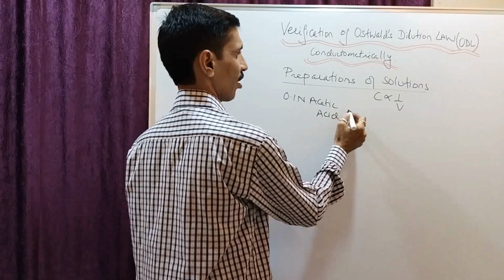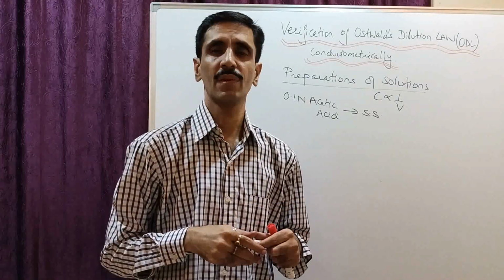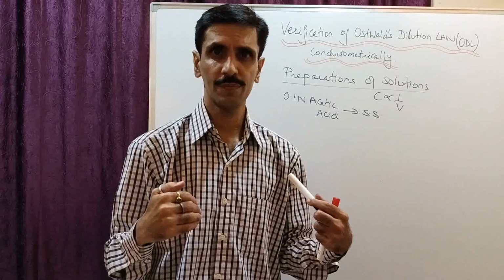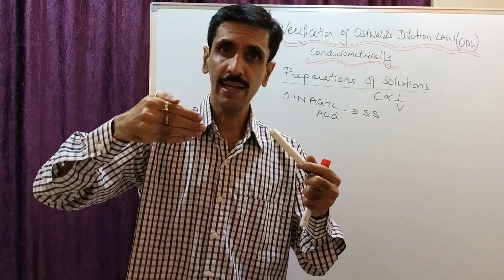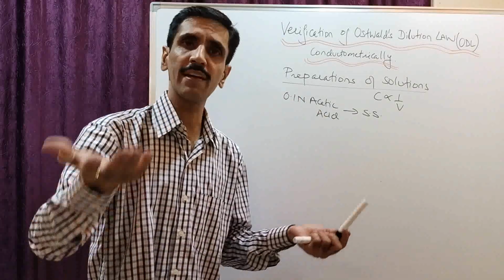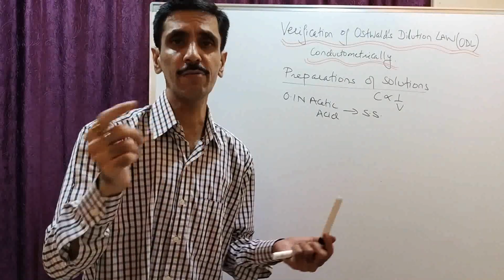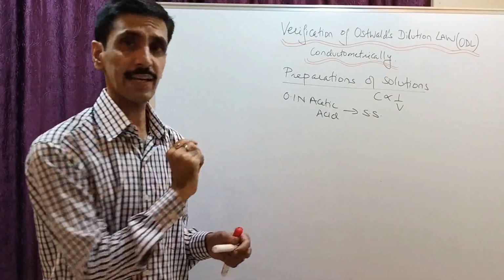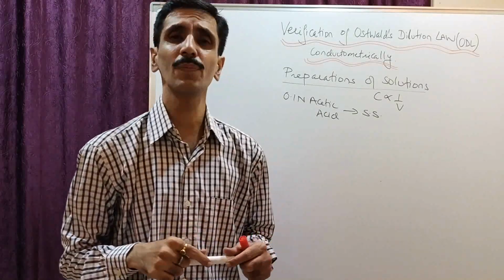Okay, which I call the stock solution, SS, is given to us. From this solution, you are going to prepare the various concentrations by dilution, of course, because the concentrations you are preparing are going to be less than this 0.1 normal. You always prepare a solution of a lower concentration from a solution of a higher concentration by means of dilution. ठीक है? तो इस तरीके से कैसे बनाएंगे, कौन से कॉन्सेंट्रेशन बनाने के और किस तरीके से बनाने के हैं, that I will explain it to you.